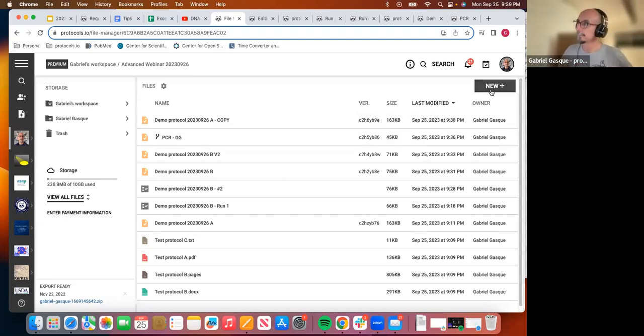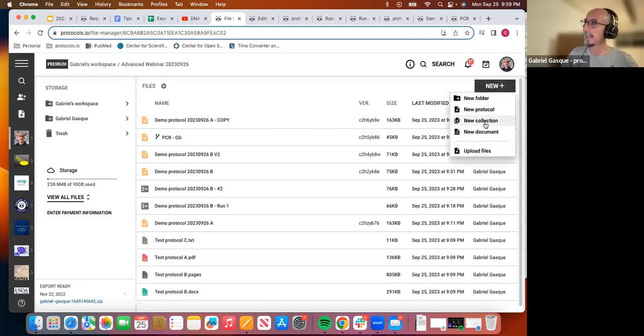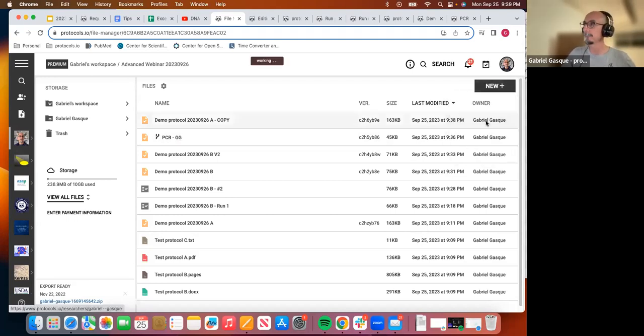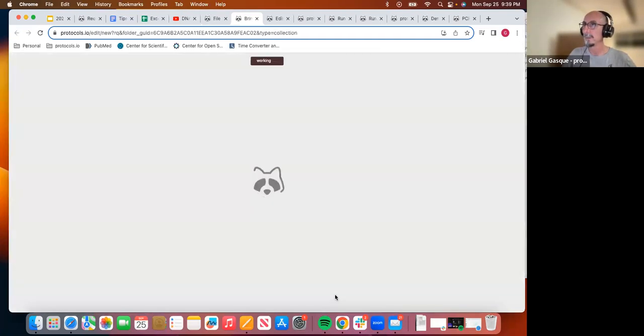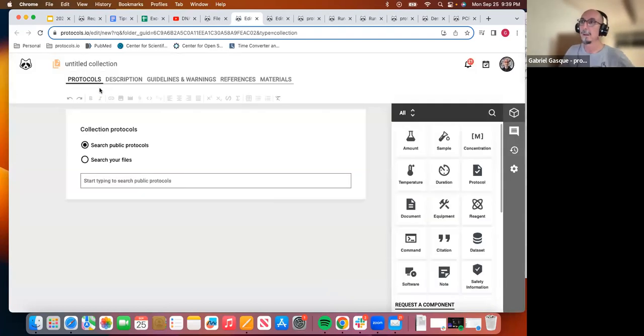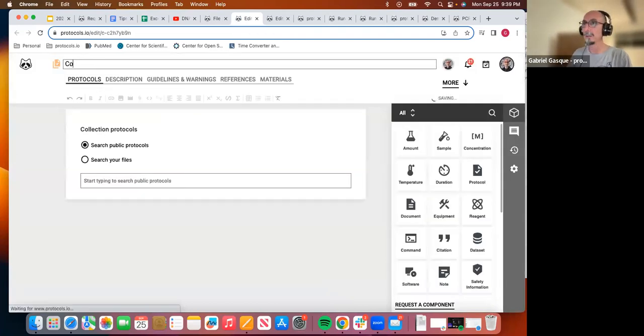To do that, I select New. I select a new collection. I can add a title to the collection.